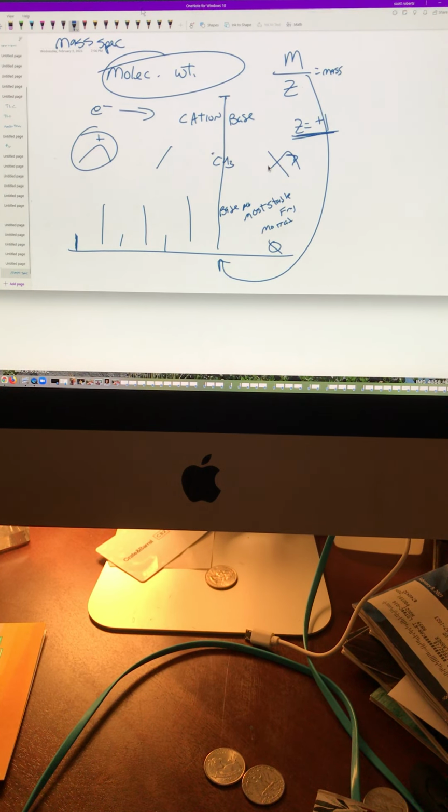That gets us answers, but it really doesn't mean much, but this means everything. That is the molecular weight. Whatever happened, say with butane, the carbocation you made stays together at some point. Your base peak doesn't have to be the molecular weight. Whichever peak is all the way to the left or right, away from zero, is your molecular weight. That's it, and it has a name too: the molecular ion. The M+ is the molecular weight of your substance.